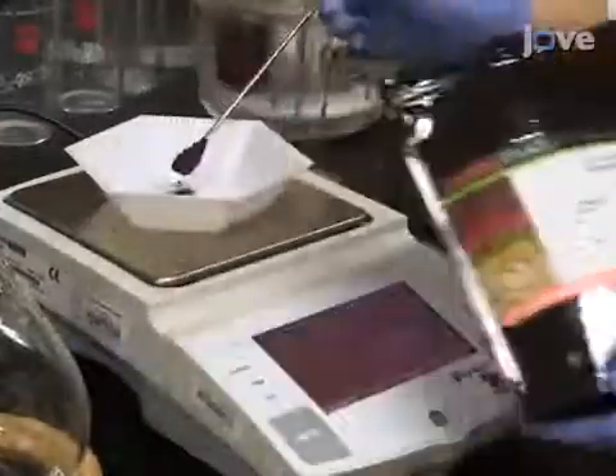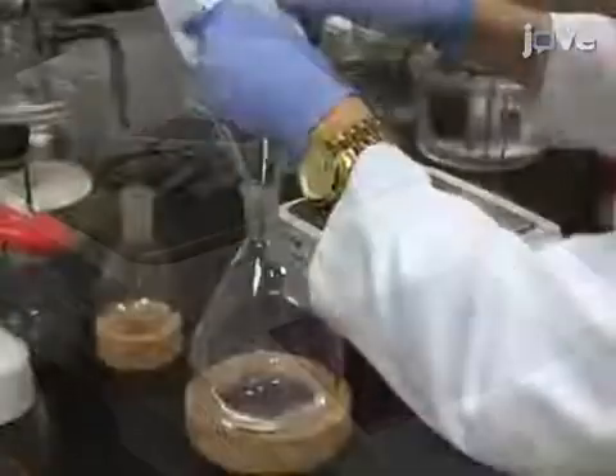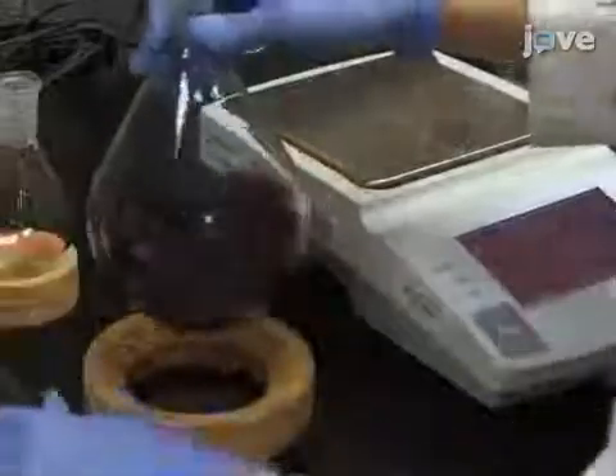Next, weigh out 10 grams of freeze-dried blackberry powder. Add the berry powder to a 1-liter round-bottom flask containing 100 milliliters of 80% aqueous ethanol.